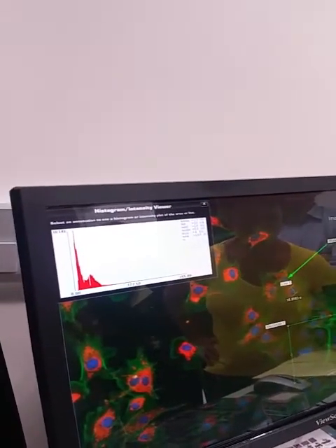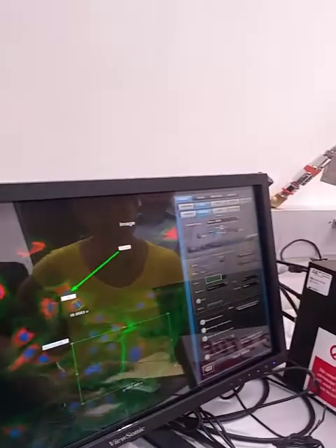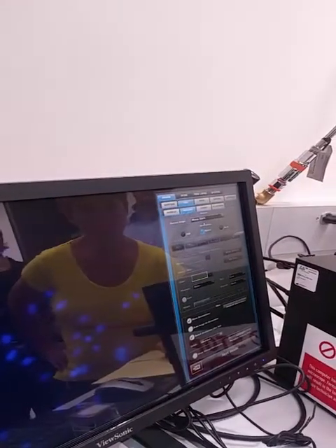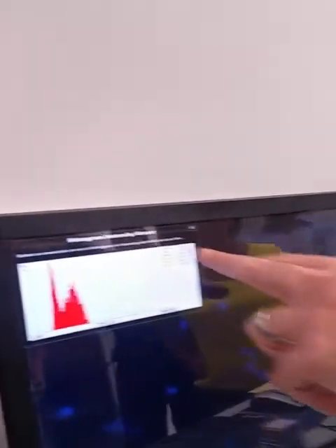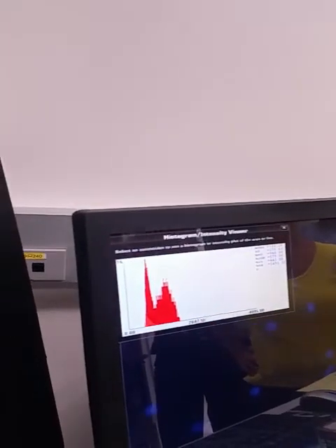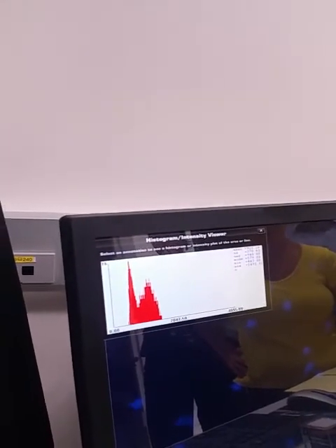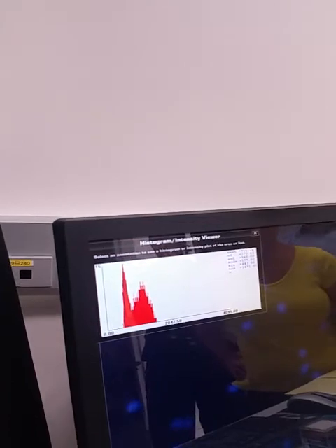If you want just one channel, you can use this drop-down menu to go to an individual channel. It gives you mean, median, and mode — essentially pixel intensity, similar to MFI.